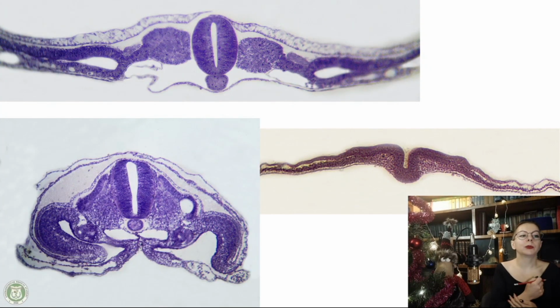Then specimens from embryology. Here we can see the somite stage of the embryo. Here we can see the late gastrula, and amniotic folds are present, forming the amnion, and this is the primitive streak. I think this specimen is difficult to recognize because it has no distinctive features, just a line, but if you find this invagination in the center of the line, then this is the feature of the primitive streak, so you have to recognize it.